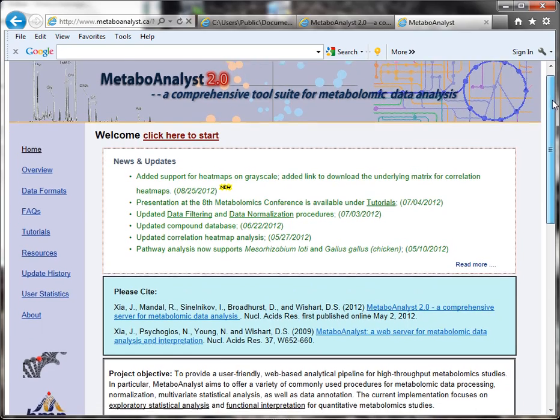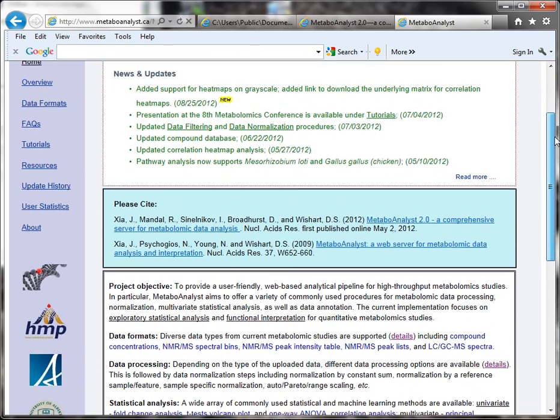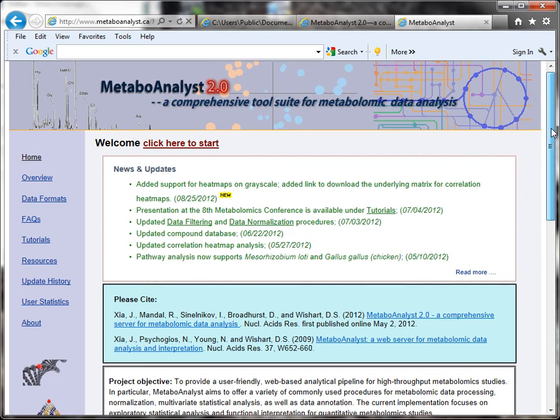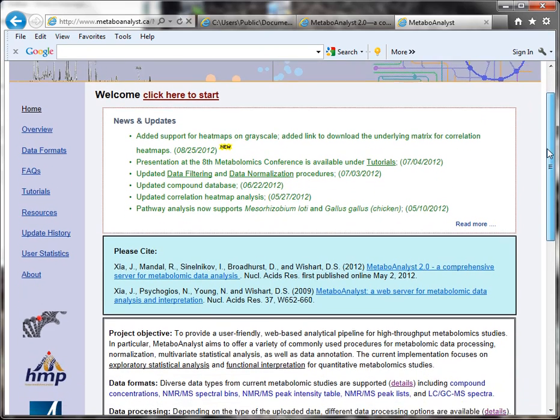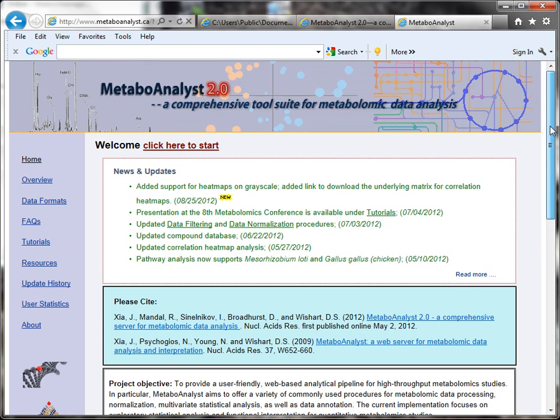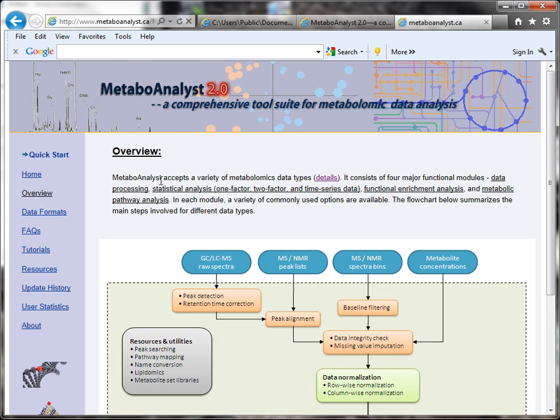Here I am showing its homepage, and I have a link to the resource as well in my post. I think probably the best way to quickly give you an idea of what MetaboAnalyst does is to click over to the overview.